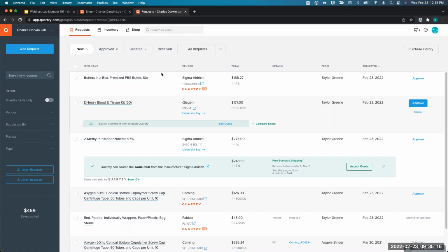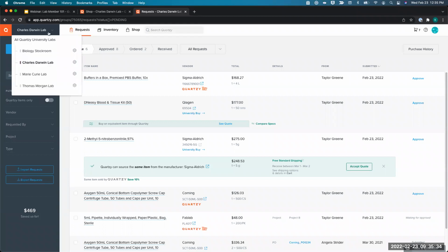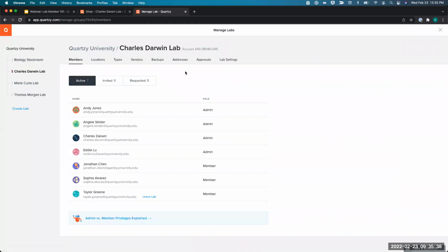All right, no more open questions, but we'll give everybody the opportunity. If there are any other questions, please ask them now. Anything else you want to show everybody, Katie, while we have this last couple minutes? Yeah, we can definitely go over some more lab management type of stuff.